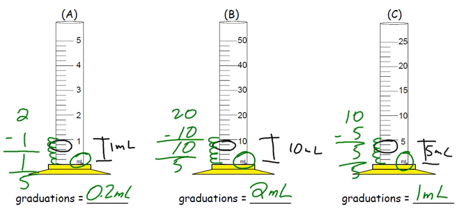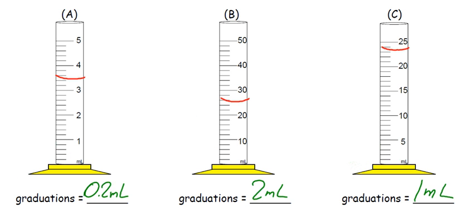If you could, I'm going to pause the video and then I'll write in these three questions. Alright, I took the liberty of erasing all the other calculations, but I still left the graduations on there. So go ahead and pause the video again and take a look at what you think these measurements are. Remember, do not forget your units.